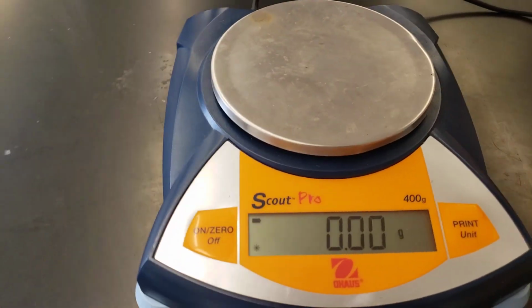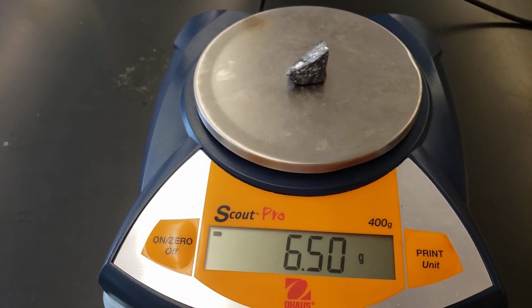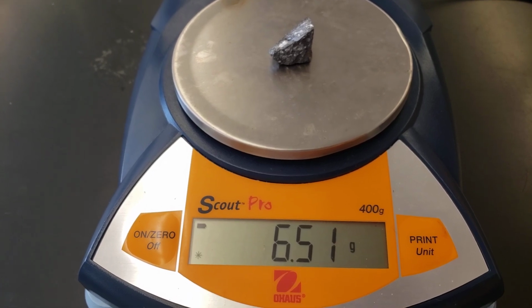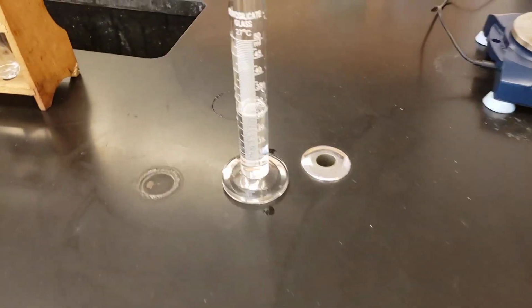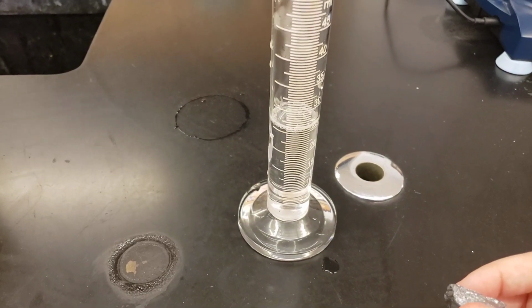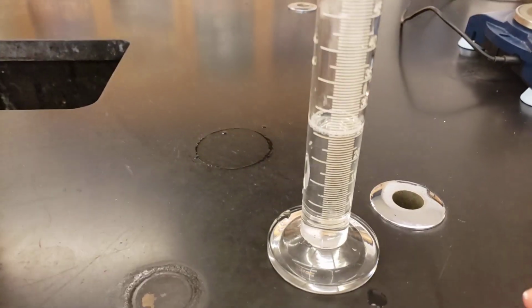So we have our balance. It right now says 0 grams. So when I put the silicon on there, we can see that we have 6.51 grams as our answer. When we move back, now we have to figure out the volume of our silicon, and the easiest way to do that is by using a graduated cylinder, just like we did in our previous units.